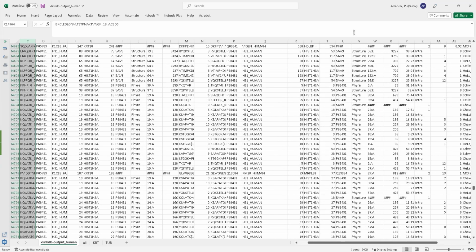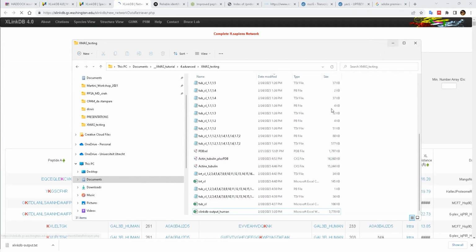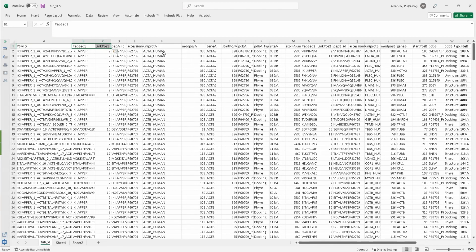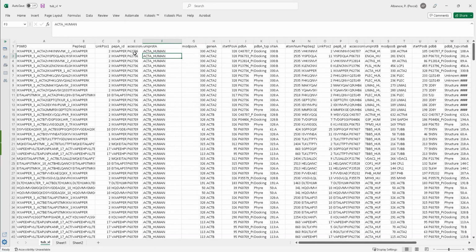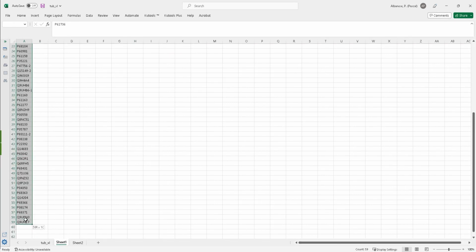So you have a lot of histones, we might expect this. Let's say we want to look at cytoskeleton, so like tubulins. So what we can do is, for example, from this big table, we can extract all proteins related to the cytoskeleton, let's say actin or tubulins. And for example, by simply copy pasting this accession number, we have a list of unique proteins. In this case, I selected 59 that are involved in the cytoskeleton functions.